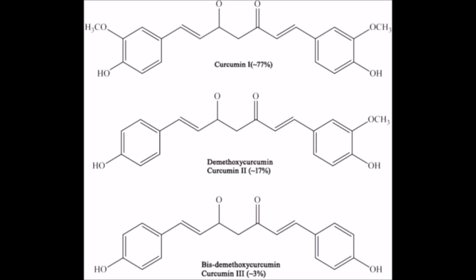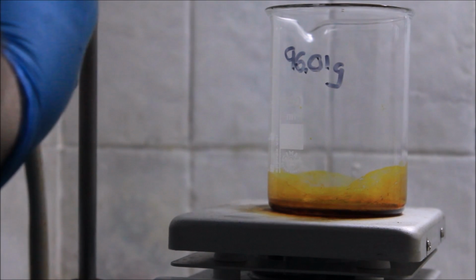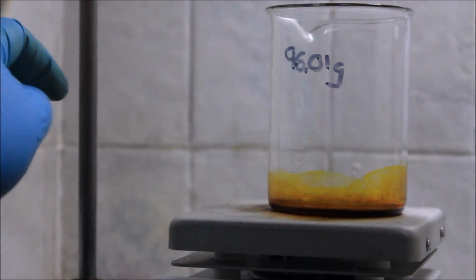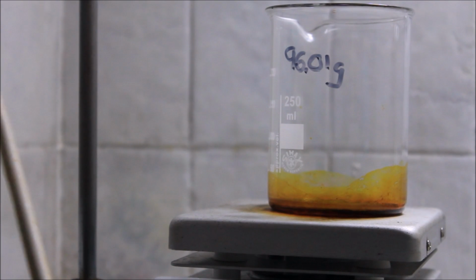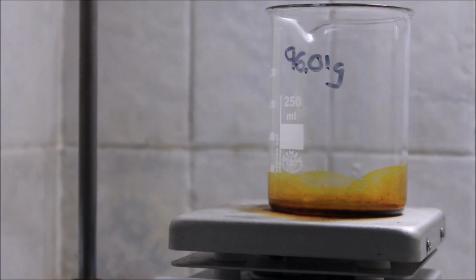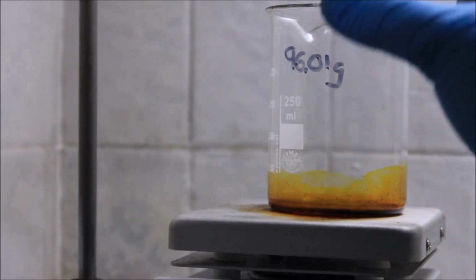The different components were identified by running a TLC in a mixture of 7:3 ratio petroleum ether to ethyl acetate. However, in the TLC only one spot showed up with a retention factor of 0.22, which is in accordance with the expected Rf value of curcumin.